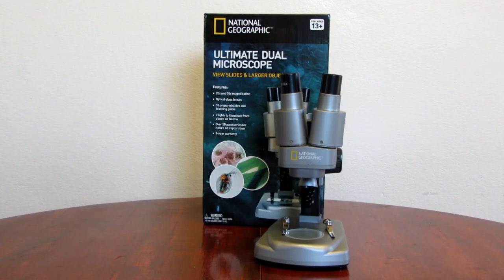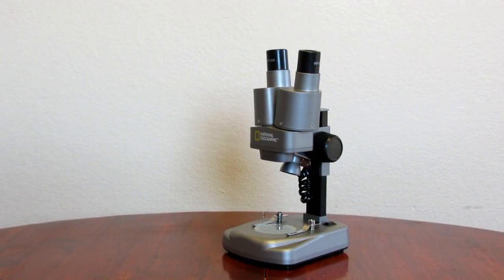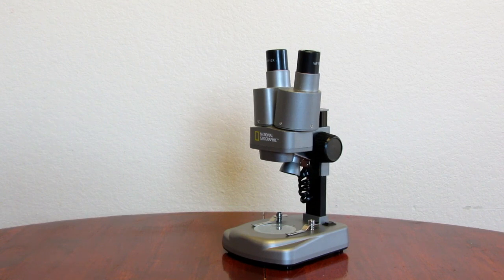I'm reviewing National Geographic's Ultimate Dual Microscope. For an inexpensive microscope, this has surprisingly clear lenses to it.